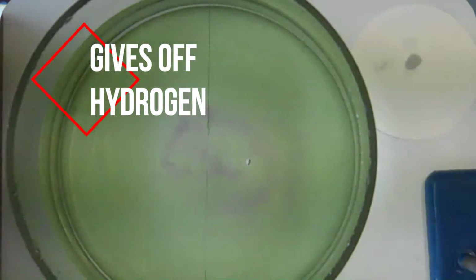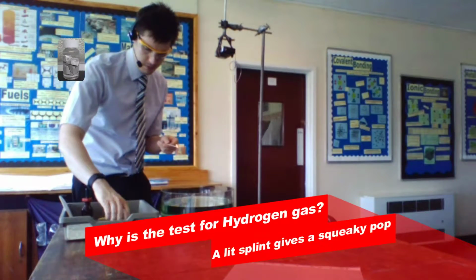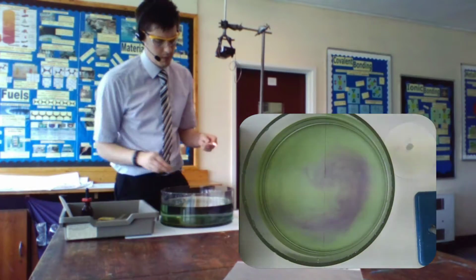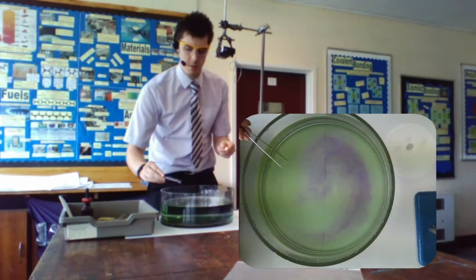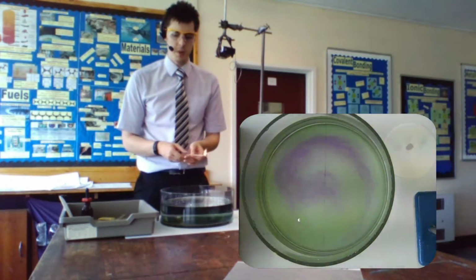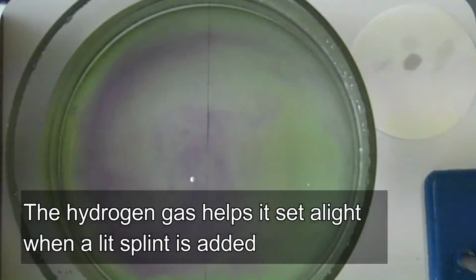You can see that there is a gas being given off, a gas that we can test with a lit splint. So I'll show you with sodium. So we drop sodium in and we'll see the comparison. Just wait for the remaining bits of oil to come off. So we can see it's floating around. It's formed a molten ball. And you can also see it sets on fire.